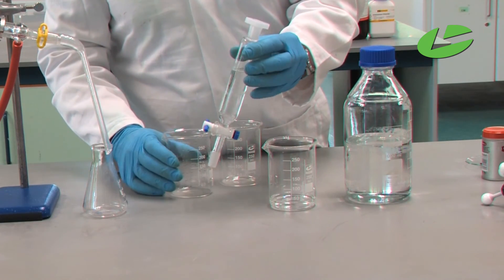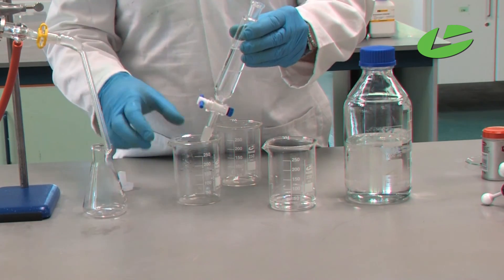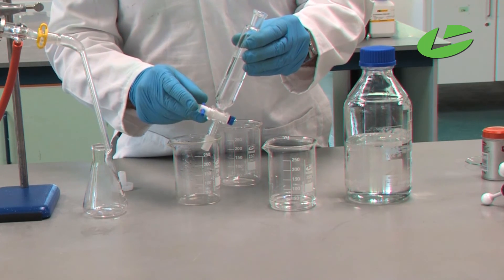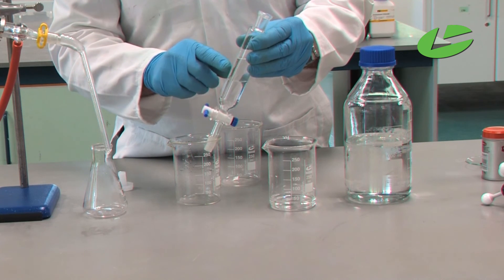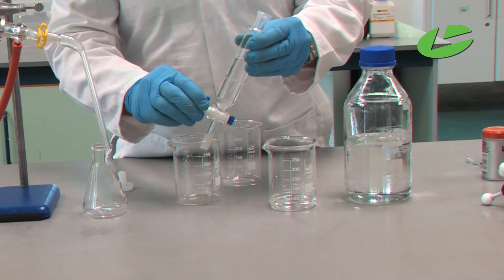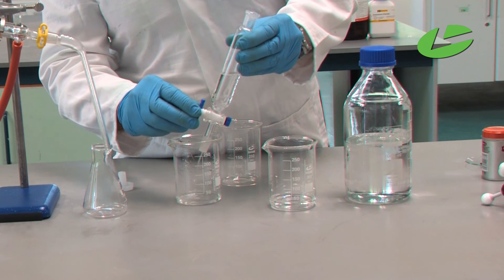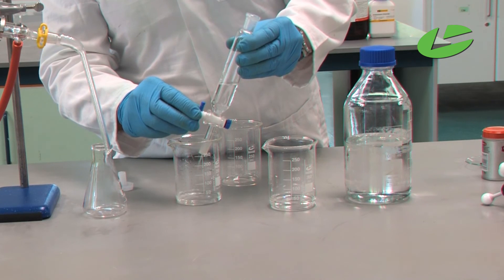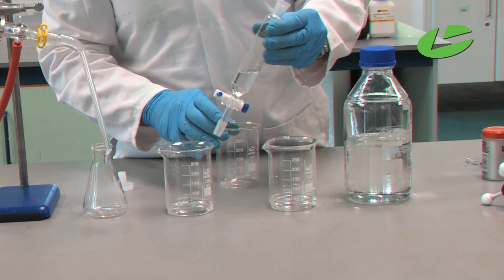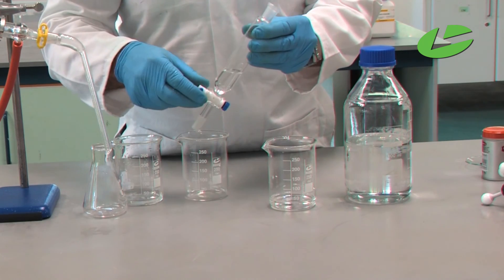Let the solutions settle, then take off the top stopper. Open the tap and let the water layer run out into a beaker, so the eugenol and cyclohexane remain in the top layer. Let all the water run out, close the tap, and then carefully pour the cyclohexane-eugenol solution into a beaker.